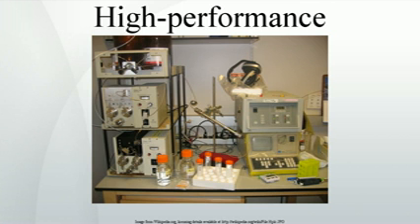Chromatography can be described as a mass transfer process involving adsorption. HPLC relies on pumps to pass a pressurized liquid and a sample mixture through a column filled with a sorbent, leading to the separation of the sample components. The active component of the column, the sorbent, is typically a granular material made of solid particles, for example silica, polymers, etc., 2 to 50 micrometers in size.